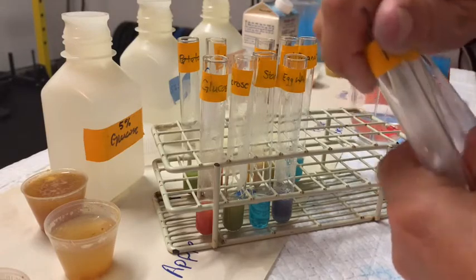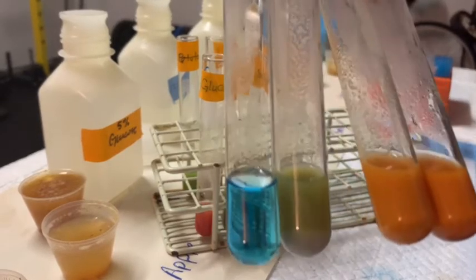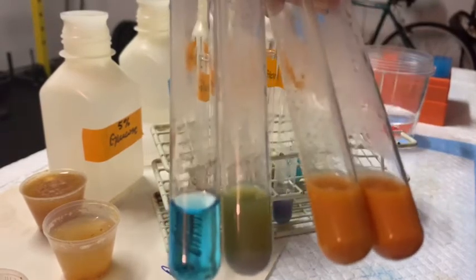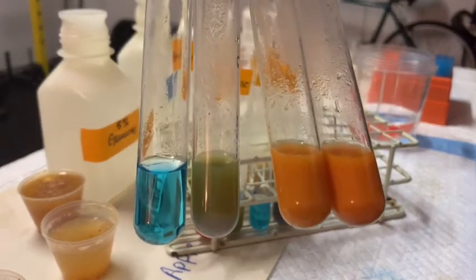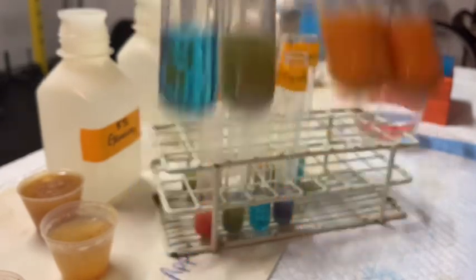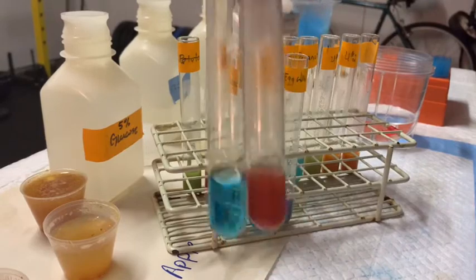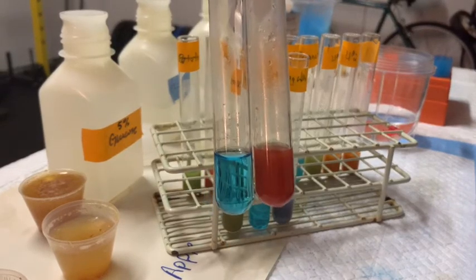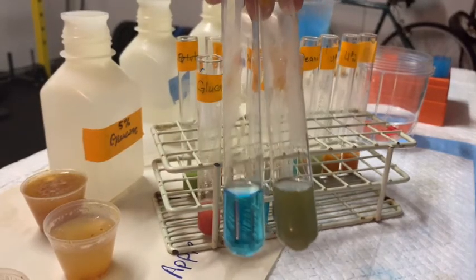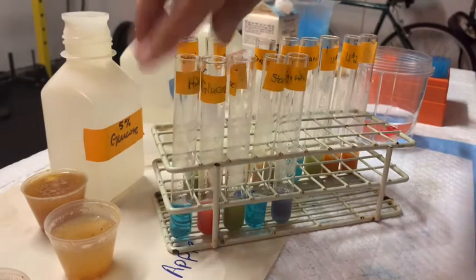Here are our three unknowns. Unknown one has a greenish color, indicative of a disaccharide yielding probably at least one reducing sugar monomer. Unknowns two and three show a nice orangey color, which is really indicative of the presence of a lot of reducing sugars. So that is the Benedict's test — showing a definite negative, a definite positive with a large amount of reducing sugars, and a somewhat positive reaction with a small amount of reducing sugars.